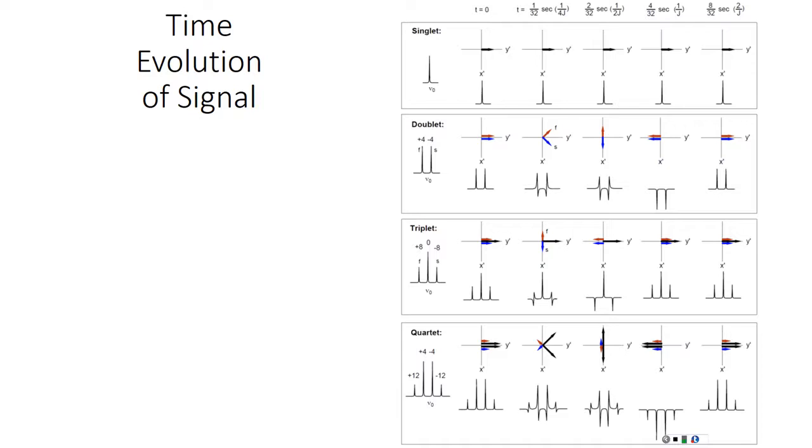If you were to look at one, you could have either the adjacent one up, contributing to the magnetic field, or down, opposing the magnetic field. So the environment that this one sees is dependent on how this one resonates. So then they'd have to be close in frequency in order to get that coupling.